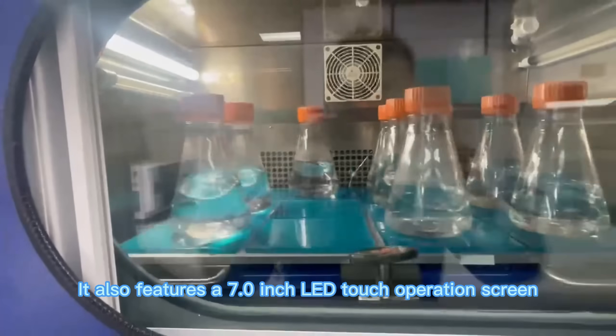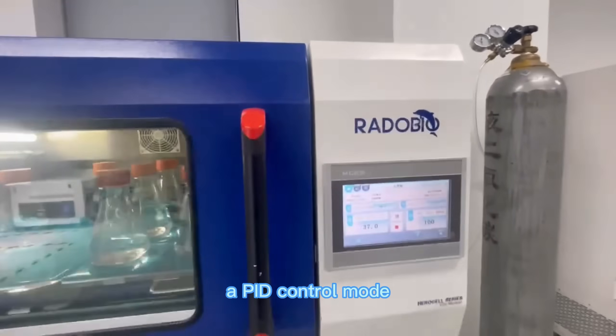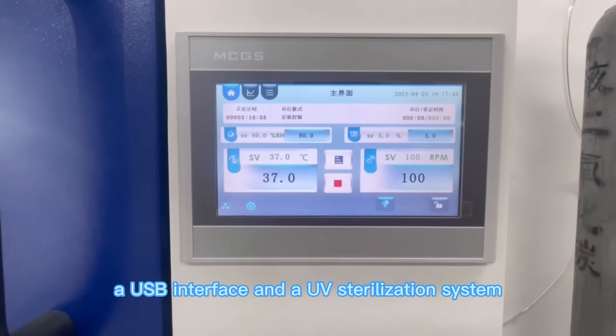It also features a 7.0-inch LED touch operation screen, a PID control mode, an infrared CO2 sensor, a USB interface, and a UV sterilization system.